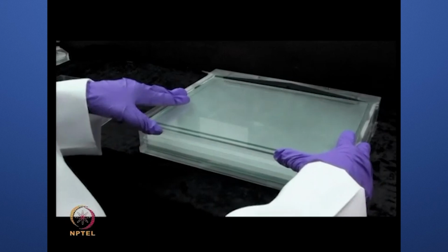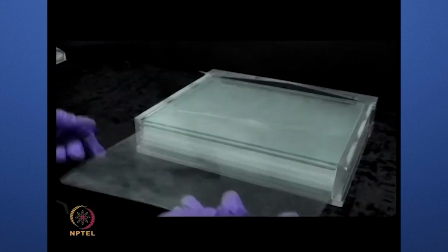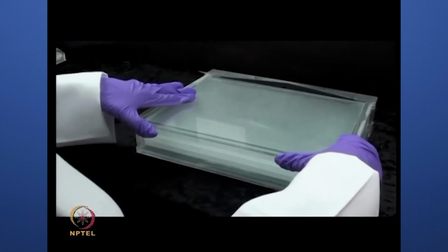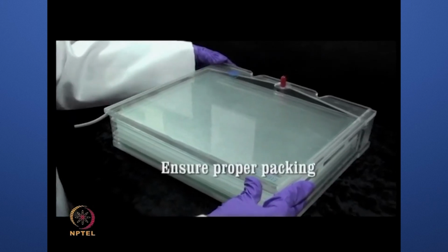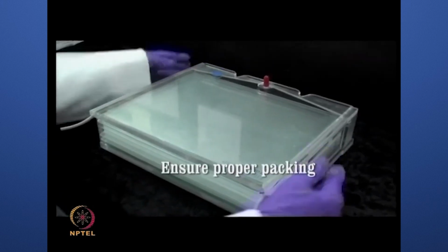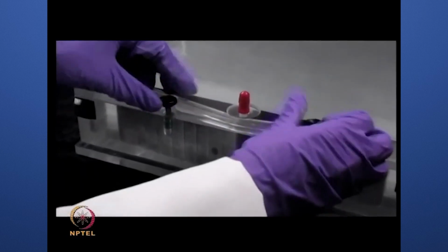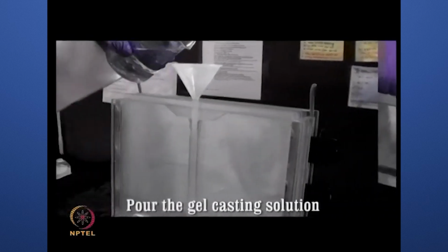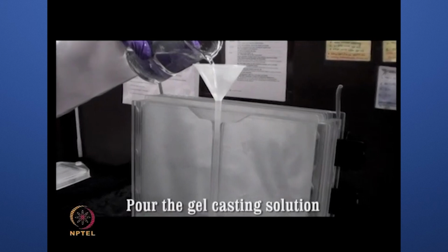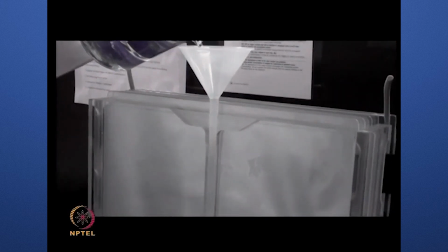The assembly should be tightly packed such that there are no leaks. Close the casting assembly and tighten the screws provided. Prepare the gel casting solution consisting of acrylamide, bisacrylamide, Tris chloride, SDS, APS and TEMED, and pour it with the help of a funnel into the central channel of the casting assembly.